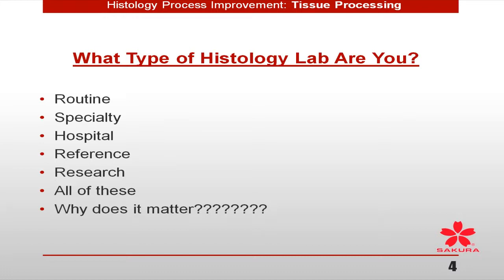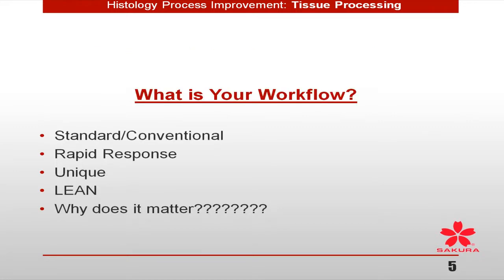So you have to really think about what are you in a histology lab. I mean, if you have a good portion of diagnostic biopsies, what are you doing different for them? So there's lots of things here to consider today. Unfortunately, I'm not going to give you all the answers, but I think it's time that we start looking at this, about what are we doing, why are we doing it, and what are we trying to achieve? And not always is our histology lab set up that way. Most of the other processes within healthcare are set up with taking those things into consideration.